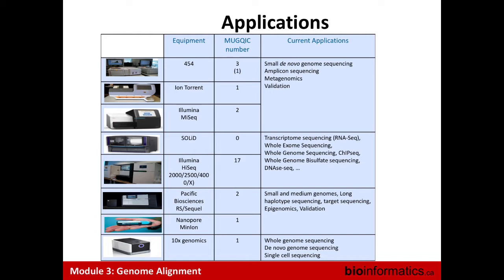I had another technology here that is not a sequencing technology, it's more a library prep technology that is really becoming a new player in the field, which is called 10x Genomics. It's a way to generate your library based on a bead system where each fragment or each cell will be amplified and the library will be generated around the beads, where you will be able to add some specific barcodes.